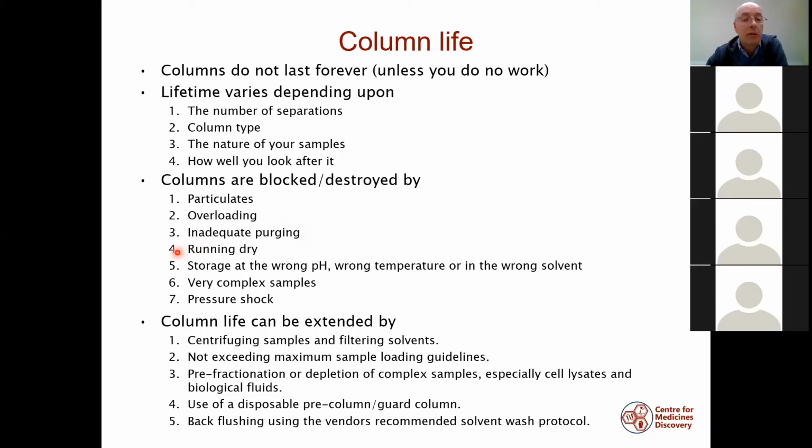How you store the column in between runs matters. If you store it at the wrong pH or the wrong temperature or the wrong solvent, this will reduce your column life. As I mentioned, very complex samples can reduce the column life. Also, pressure shock. This is suddenly going up to very high pressure, which can shorten the life of your column.